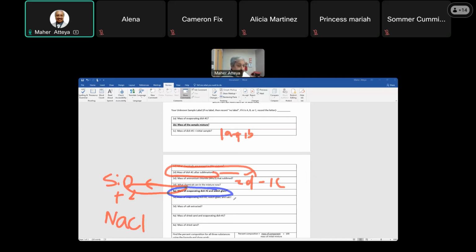At the end, get a spatula, and whatever is in the watch glass, any crystal left, white sodium chloride, put it back inside dish number 2 and go and weigh, right? And you go and weigh this one here. You know this one's mass, and the mass now with the sand. The difference in weight will give you the sand amount.